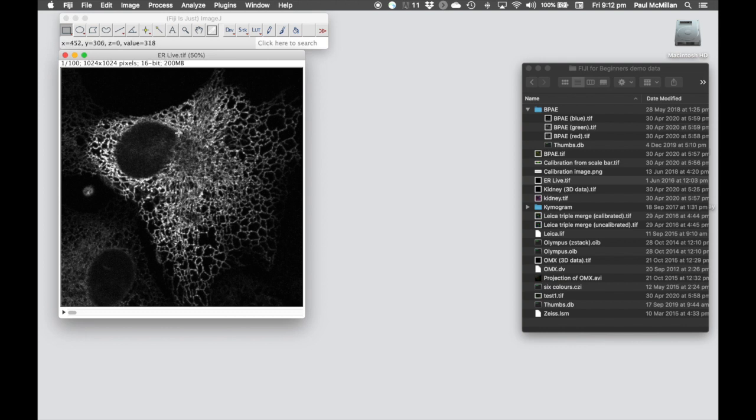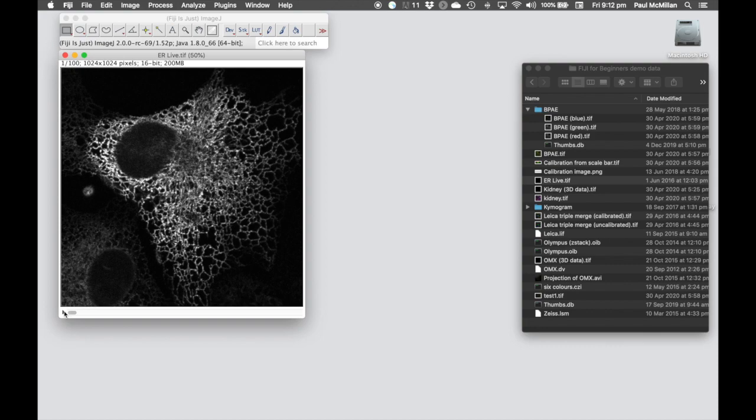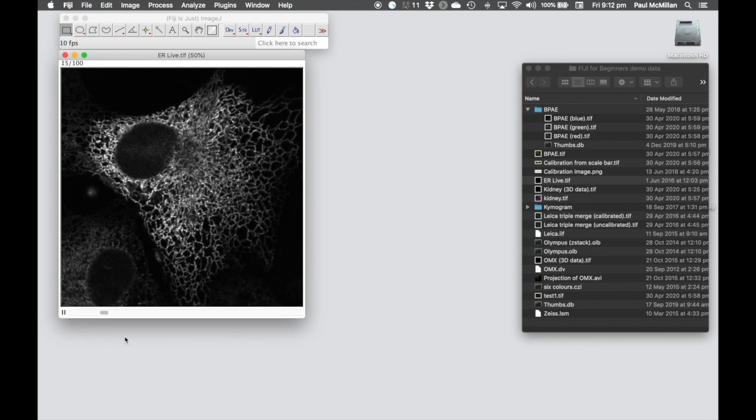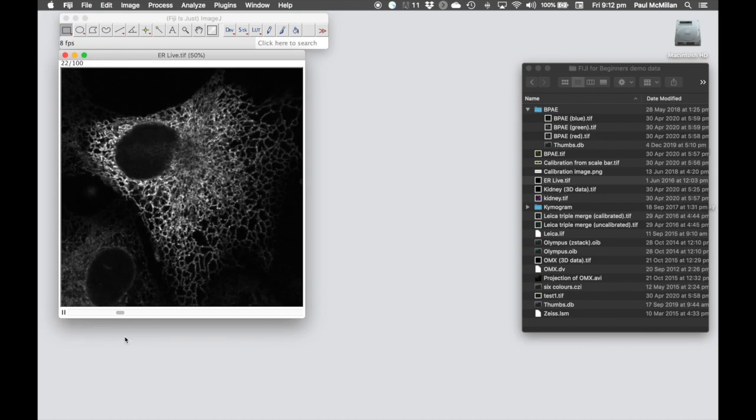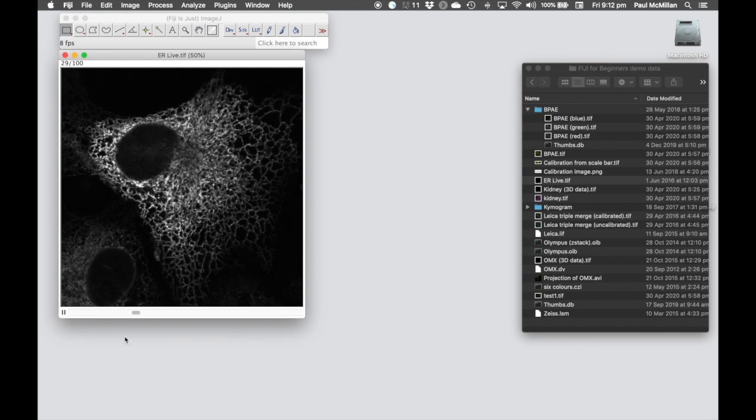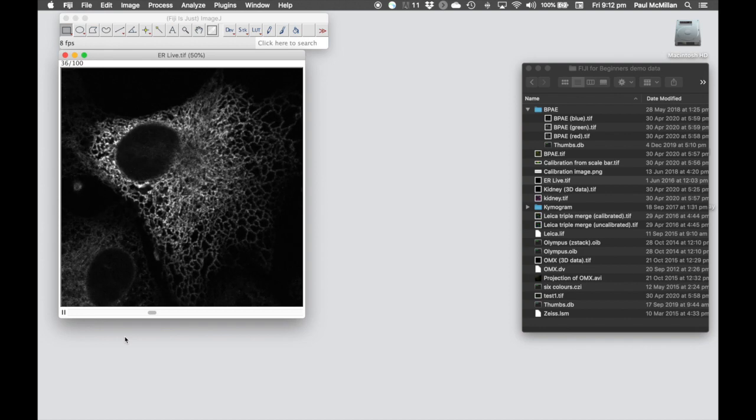And in this example, this is live cells, 100 frames of an endoplasmic reticulum stain. And you can see the cell over time, the endoplasmic reticulum is fairly dynamic.